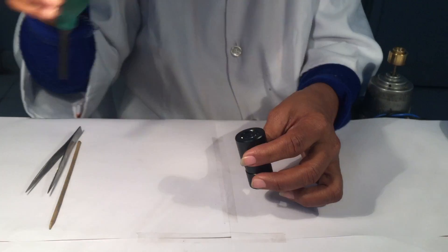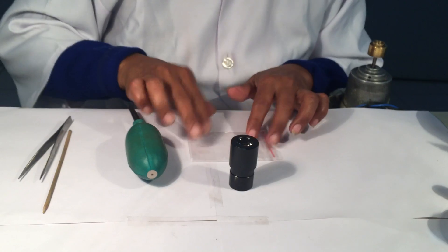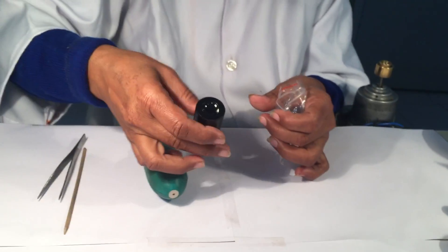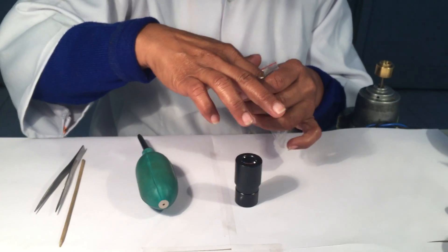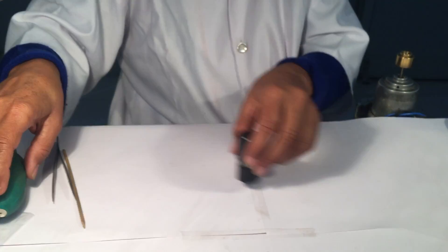And we will air blow the same, just in case any dust particle is left. Just to check whether the eyepiece is correct, we will place it on the microscope and we will check on the slide itself.